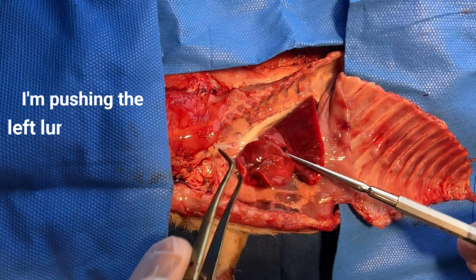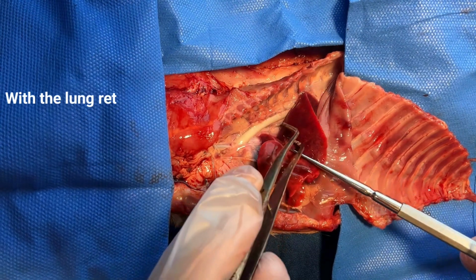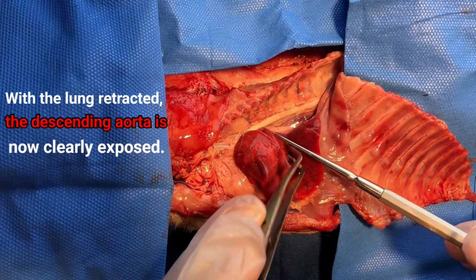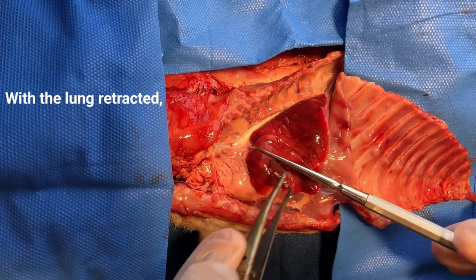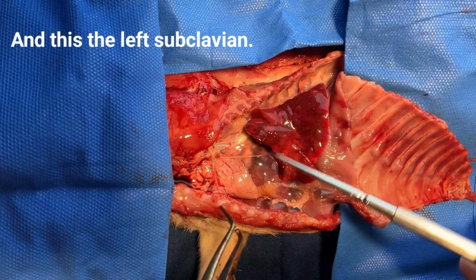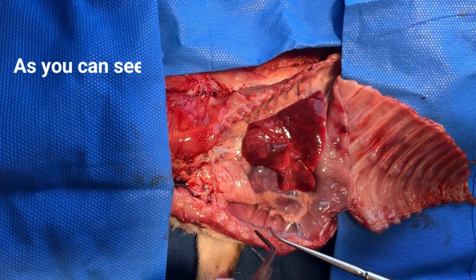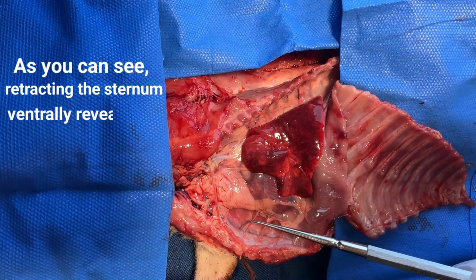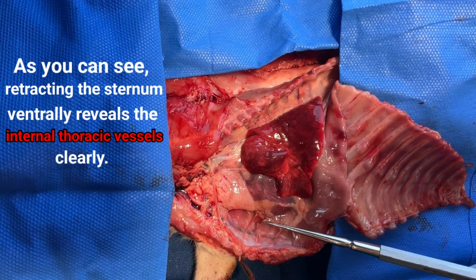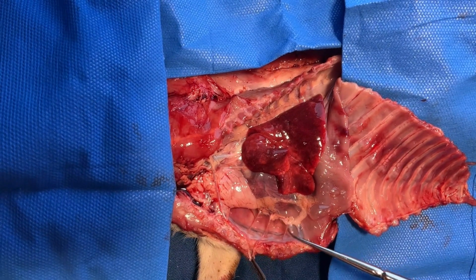I'm pushing the left lung ventrally. With the lung retracted, the descending aorta is now clearly exposed. And again, you can see the left subclavian. As you can see, retracting the sternum ventrally reveals the internal thoracic vessels clearly. These vessels are within the mediastinum.